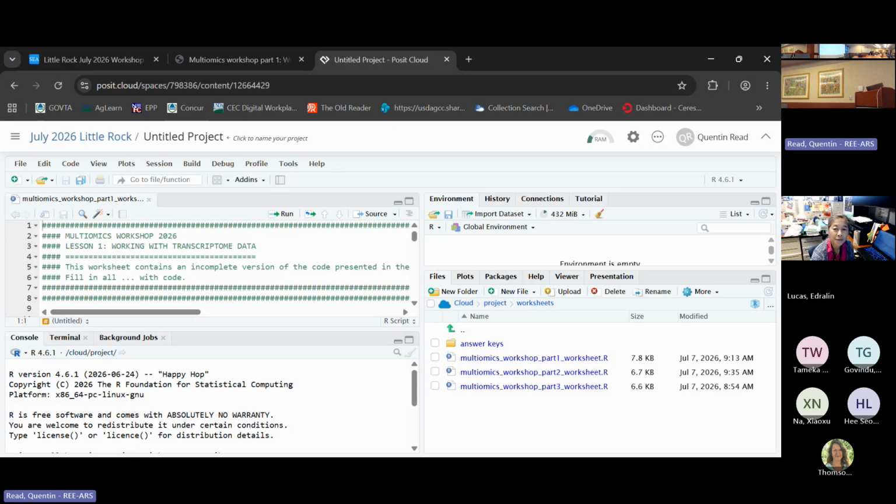Somehow you got lost at the end of it. Did you already do this, or is it the first time you're doing it? Just copy one line at a time, maybe. Just go ahead, because if it's already installed, the worst case scenario is it gives you a warning.